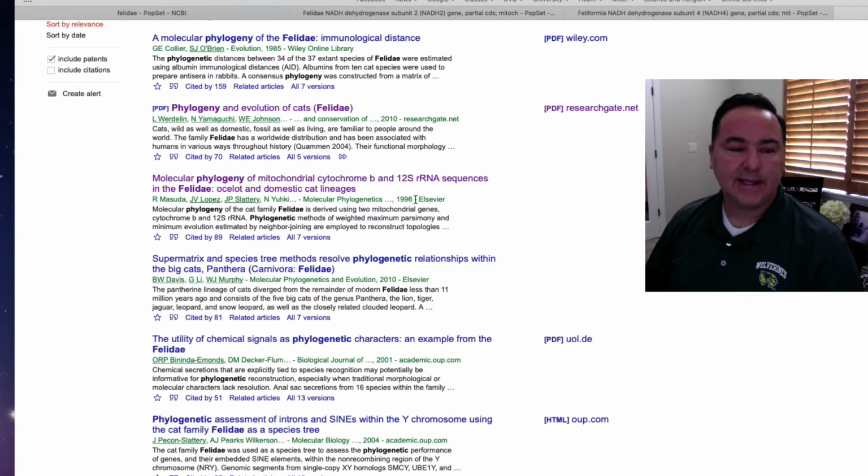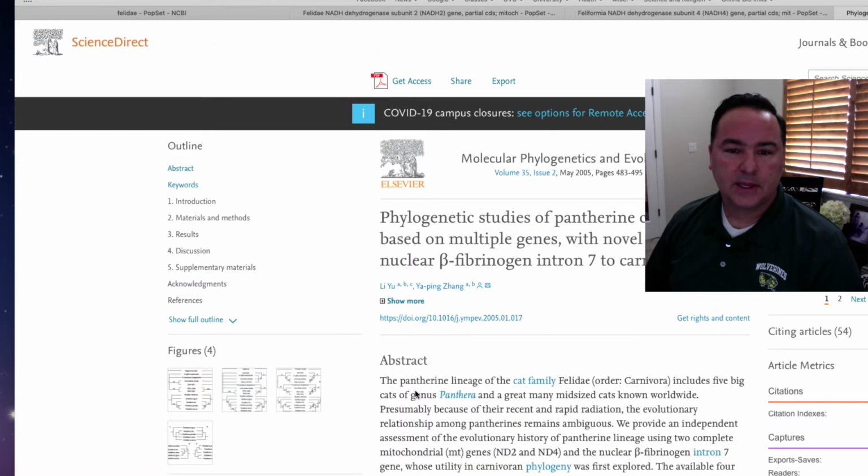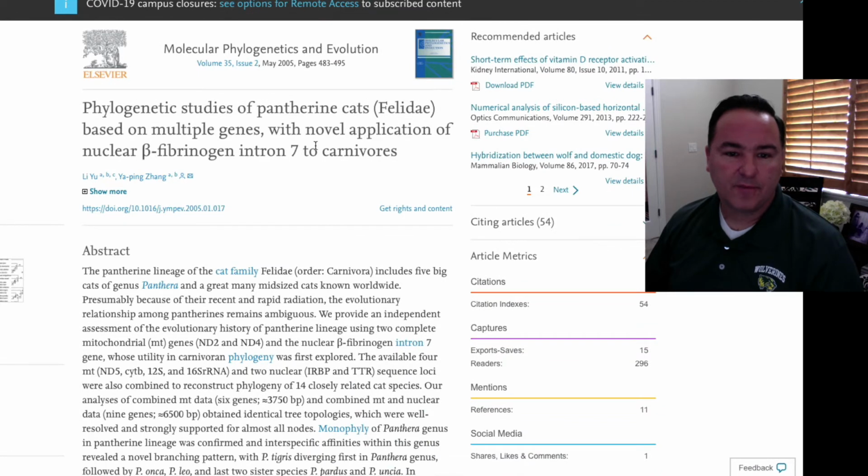I look at the dates of these things. This one's 1996, so maybe it's a little old. Okay, here's one from 2005, so let me look at this one. Yeah, this looks like a reasonable thing. It's coming from multiple genes, so I know I could get at least two genes here.